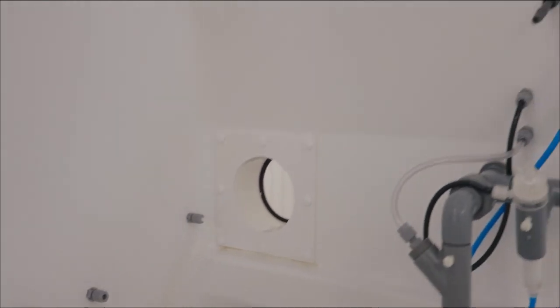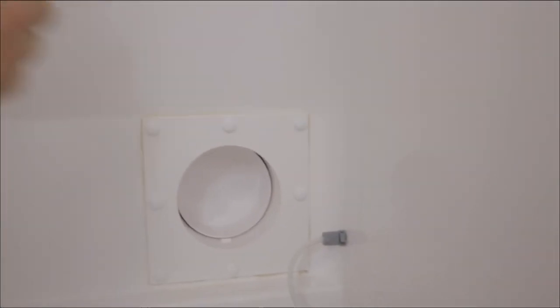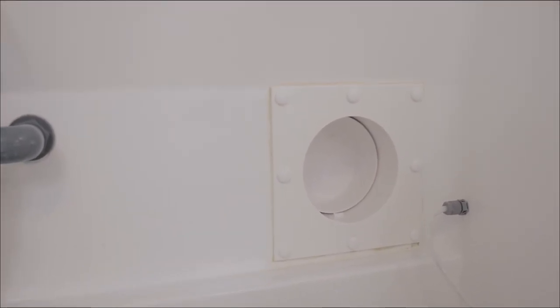This chamber also has an optional accessory entry port which the customer can pass cables or devices through into the test space when testing is actually in progress.